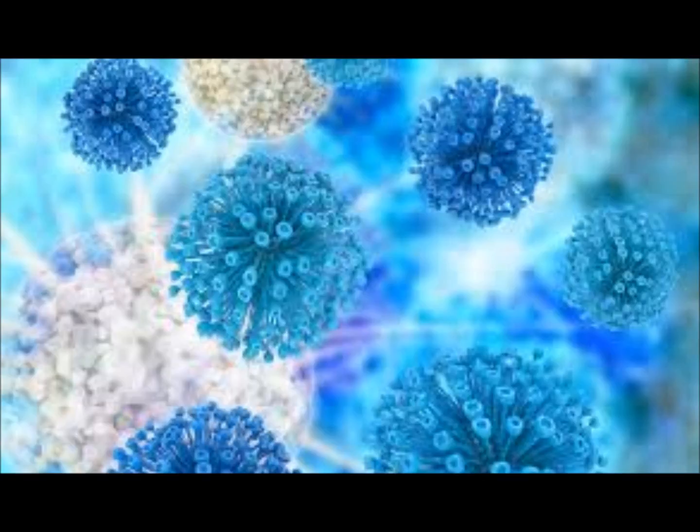Someone look at the yeast today. I think it's organism 7. Who had Candida yesterday? I know it was only one plate. Did you guys get it, Chris? You and Leah? Today, take a look, all of you, if the edges are smooth. They're sometimes not on yeast.